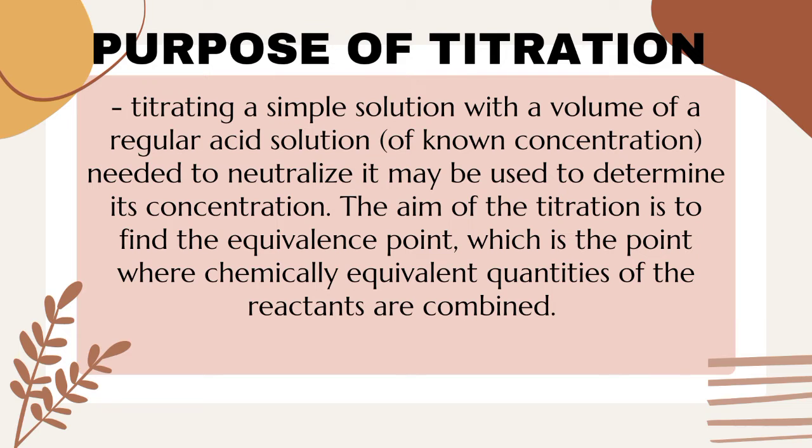Titrating a sample solution with a volume of a regular acid solution needed to neutralize it may be used to determine its concentration. The aim of the titration is to find the equivalence point, which is the point where chemically equivalent quantities of the reactants are combined.